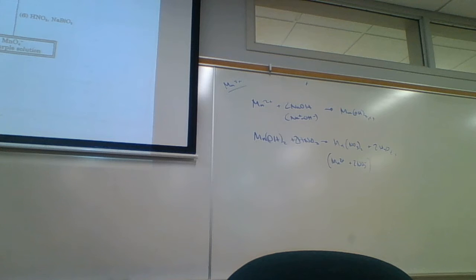It's located in that hood over there. You haven't gotten to it. The reason I kept it in the hood over there is so you don't accidentally breathe it in. What do you think is a stronger oxidizer, chlorine or sodium bismuthate? Sodium bismuthate is a much stronger oxidizer. And what did that guy die from at Buffalo Wild Wings?